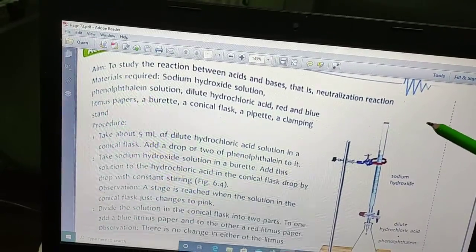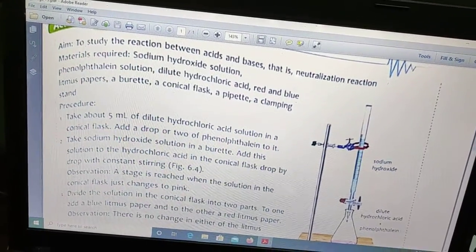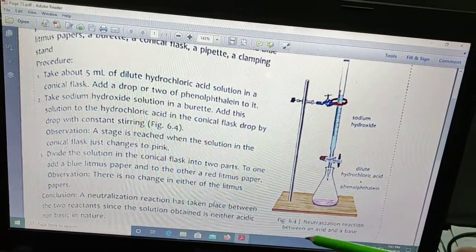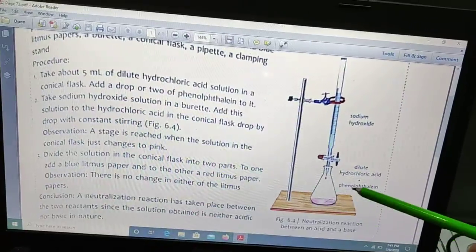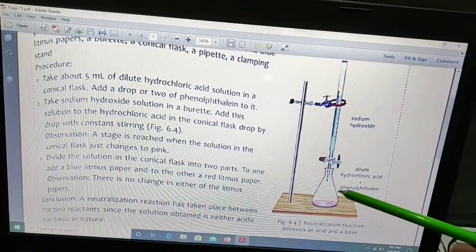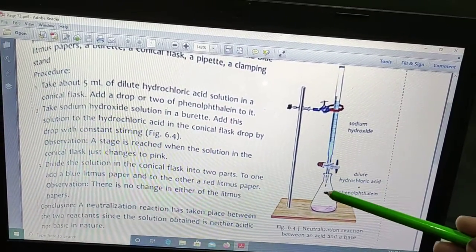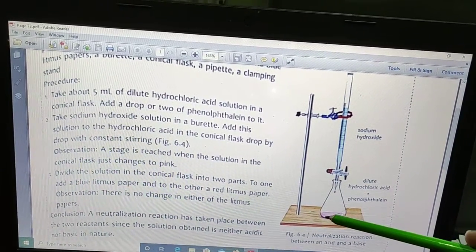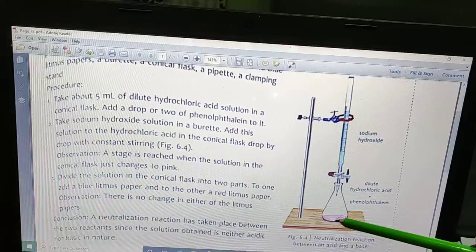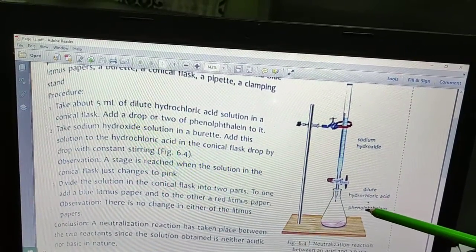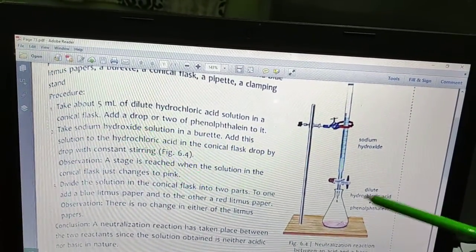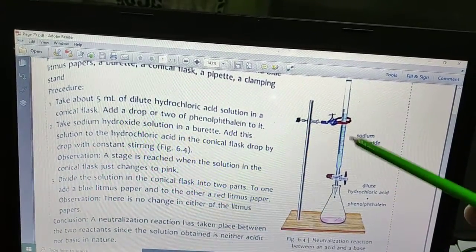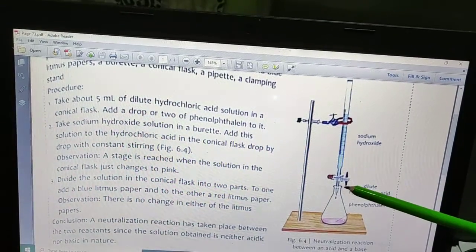Now over here there is an arrangement for this. In the conical flask, this is the conical flask and this is the burette. In the conical flask we have taken 5 ml of dilute hydrochloric acid and we have added phenolphthalein indicator. In dilute hydrochloric acid it is a colorless solution. And in the burette we have sodium hydroxide.